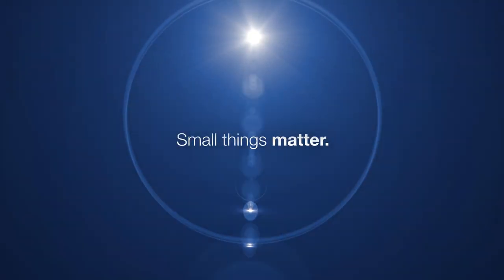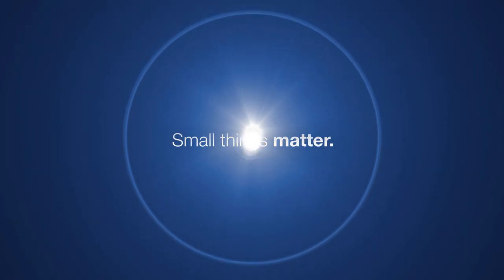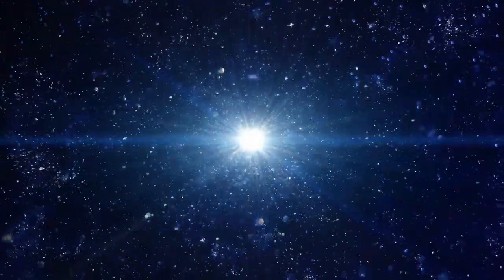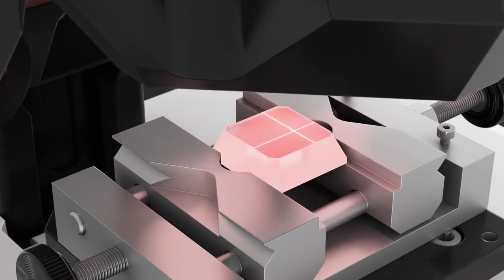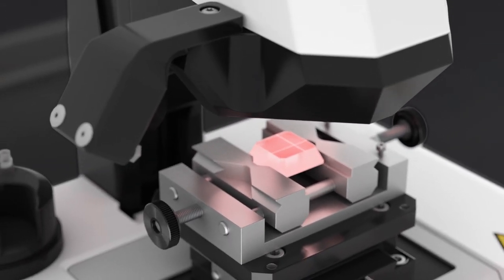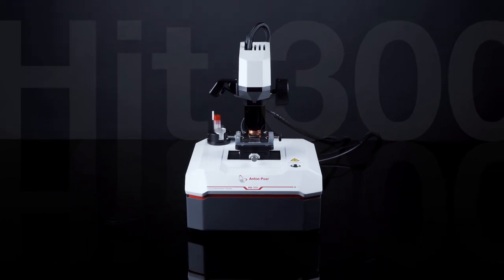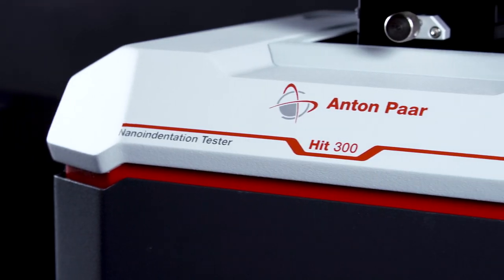In science, small things matter: the protons, neutrons and electrons, the atoms, the nanostructures and micro coatings. Inspired by their power, we set out to give small a big stage. Introducing HIT 300, the world's smallest premium nano indentation tester.